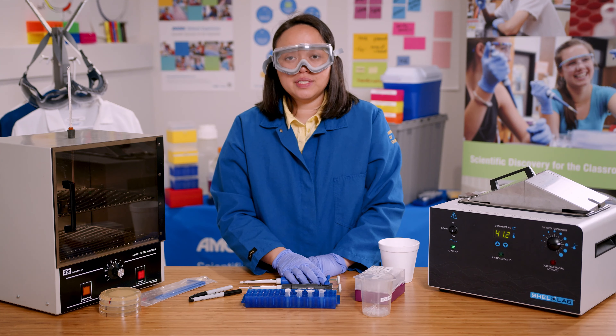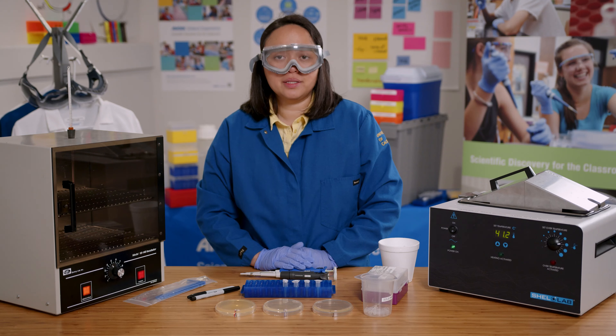I will give them 15 minutes to recover and start reproducing before moving them onto plates. Now I'm going to plate the bacteria.